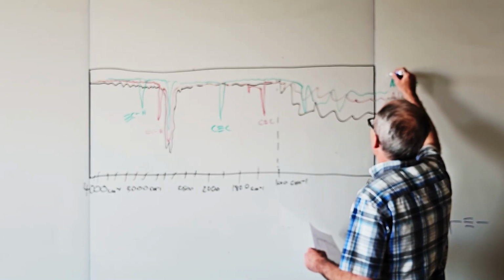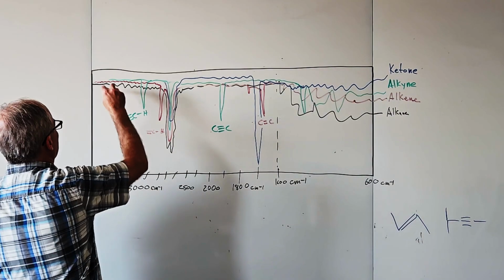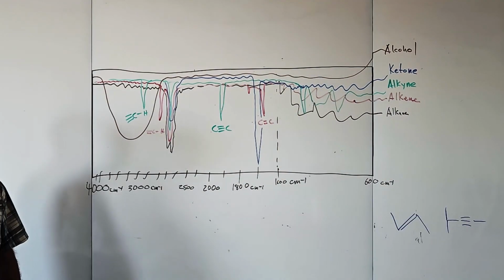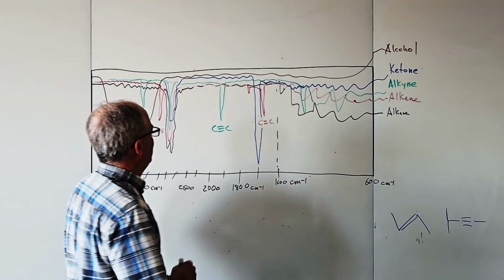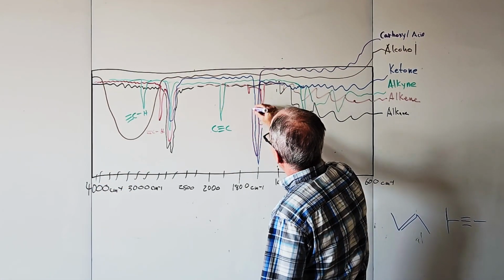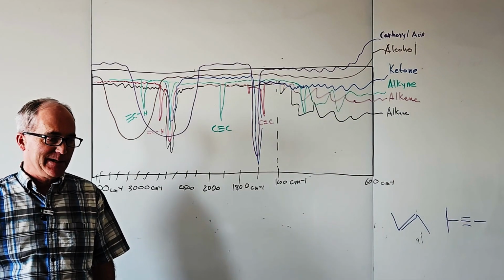All right, next up, there's the ketone, and there's the alcohol. Any questions? I guess I have purple. Same type of thing. Still got carbonyl carbon. Well, that's it. We'll be moving on to mass spectrometry.